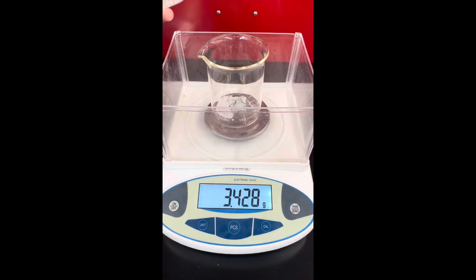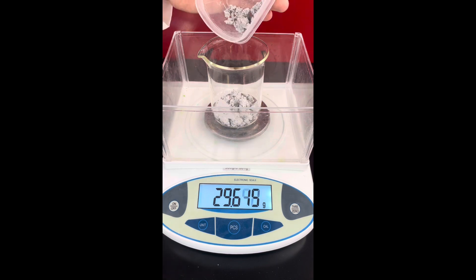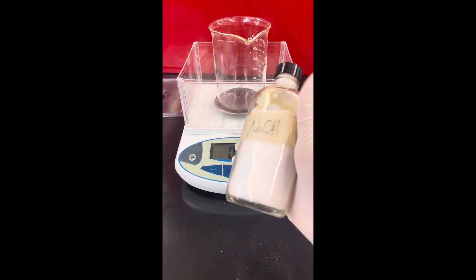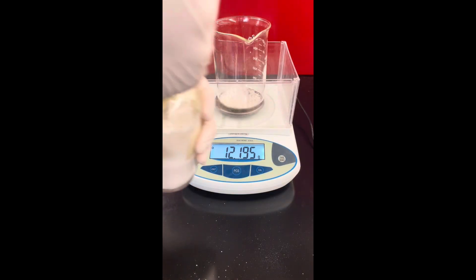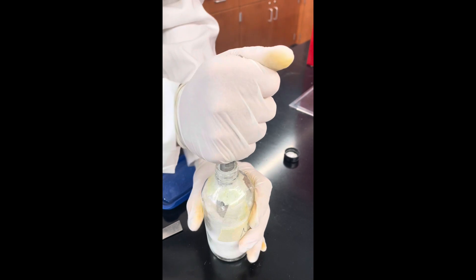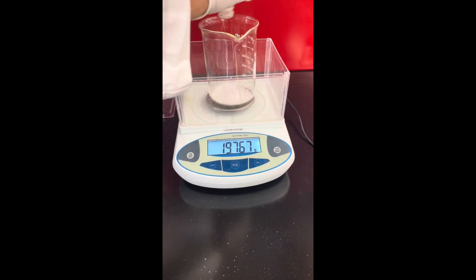We'll start by measuring out some zinc oxide or zinc hydroxide into a beaker. I was able to get around 40 grams of zinc oxide from zinc alkaline batteries, but zinc hydroxide or another source of zinc oxide would work just as well. Next, I add some sodium hydroxide to a beaker. Unfortunately, because it's hygroscopic, some water got into the jar and it was really hard to get the sodium hydroxide out.